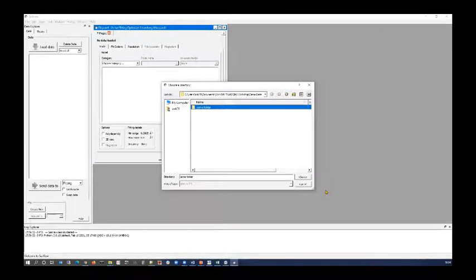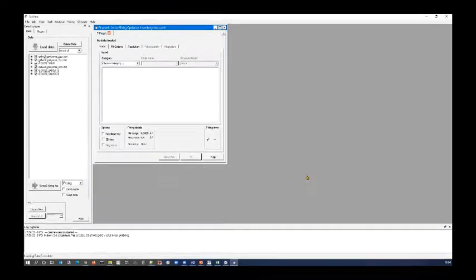So here's a folder. And you can see some data sets have appeared in the Data Explorer. These are the same data sets I showed you in the first half of the session, where I was talking about different file formats. Now, you'll notice that 3 files there have got the same name, so the program has had to stick a number in brackets after them to differentiate them. That's because it's read some metadata from inside the file, and it's tried to be helpful by telling us what the data is rather than just giving us the file name. But of course, in this instance, it's actually unhelpful.